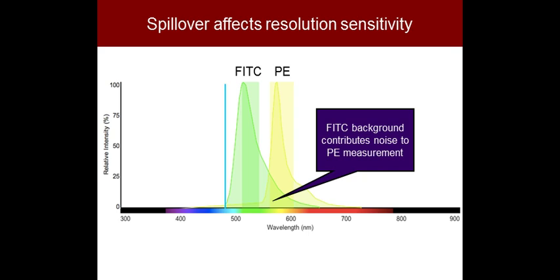We could capture more of it, right? We could use a broader filter. Why does that filter not extend down lower to capture more of the FITC peak? Well, I'll answer it for you, but maybe you've already figured it out. It's because of that blue laser line.